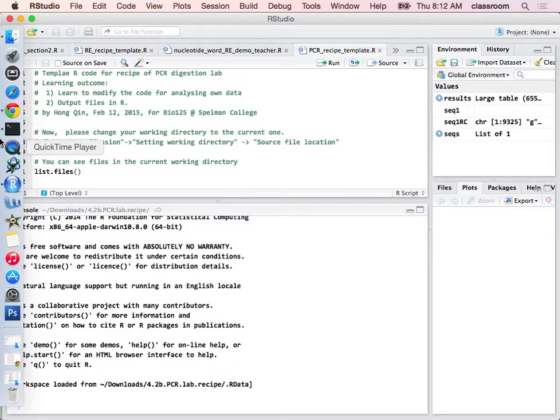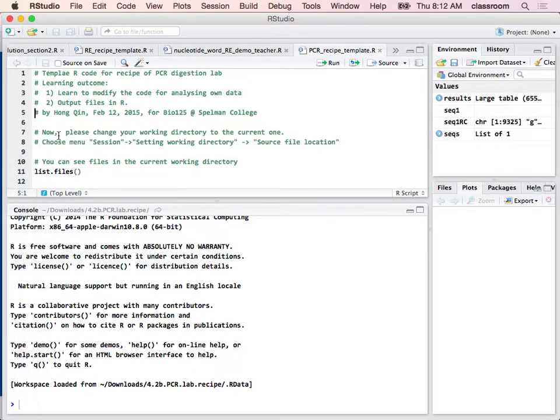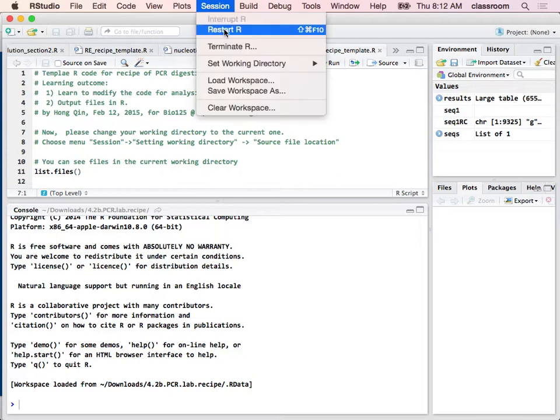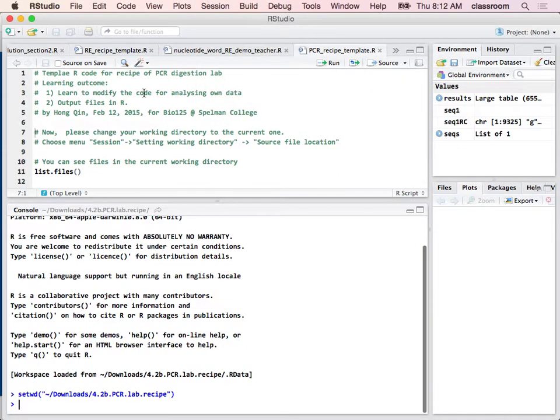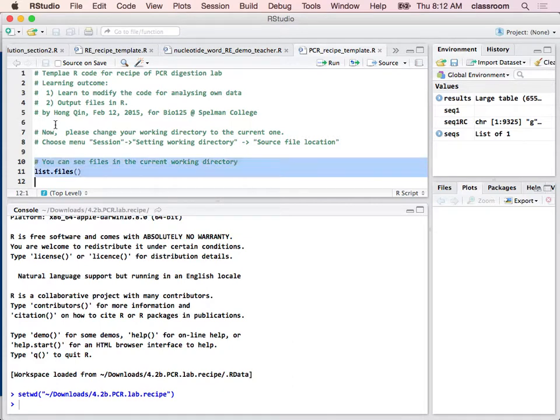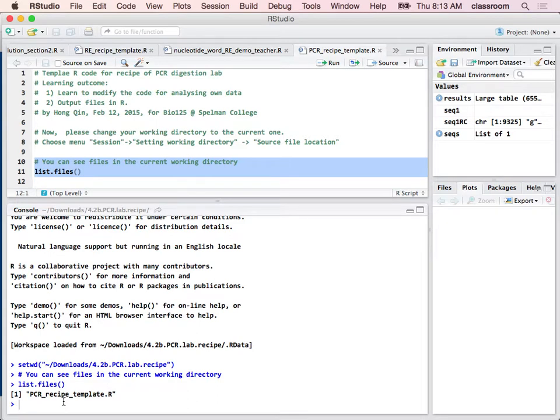So this time, I'm also going to output a file. So you want to make sure you know which directory you are working at. So again, I want to set my working directory to the source file. Once you do that, you can list all the files. You should only see one file, PCR recipe template.